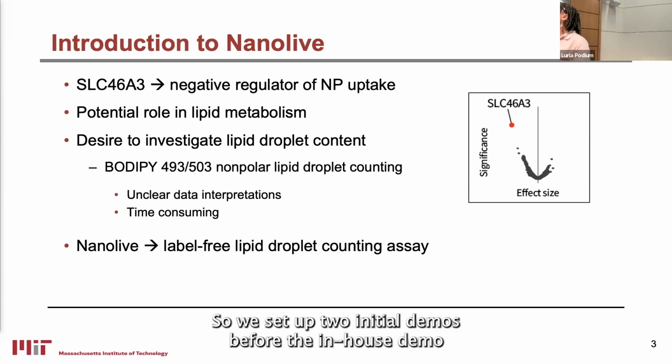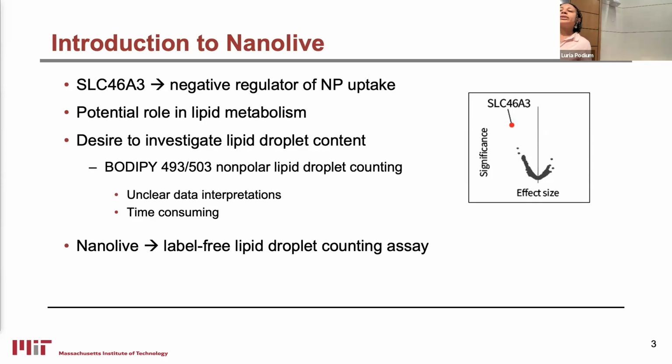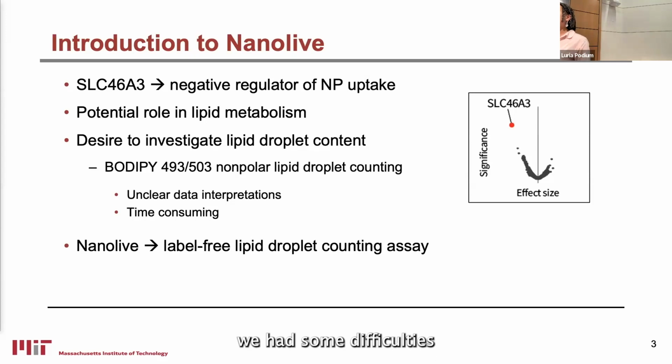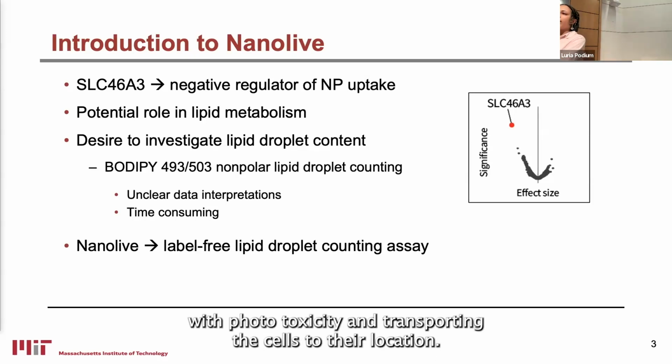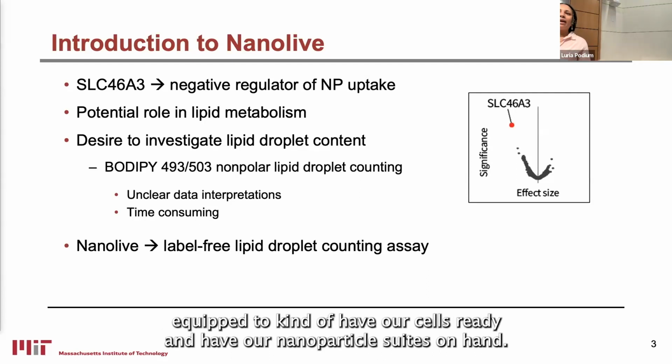So we set up two initial demos before the in-house demo, and at the first demonstration, we were like, hey, wait, could this be used for nanoparticles? And at the second demonstration, we had some difficulties with phototoxicity and transporting the cells to their location. So that led to us hosting an in-house demo here at the KI, where we were better equipped to have our cells ready and have our nanoparticle suites on hand.